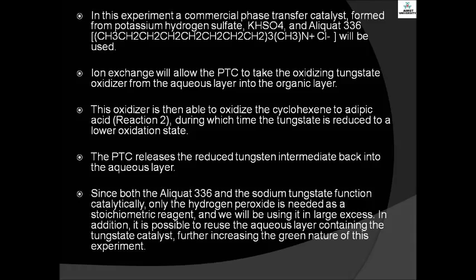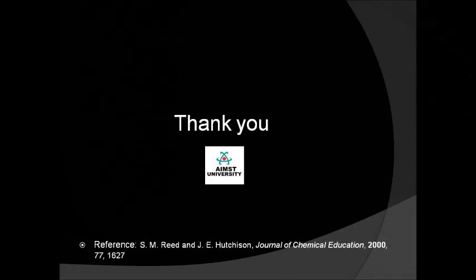Since both Aliquat 336 and sodium tungstate function catalytically, only the hydrogen peroxide is needed as a stoichiometric reagent, and we will be using it in large excess. In addition, it is possible to reuse the aqueous layer containing the tungstate catalyst, further increasing the green nature of this experiment. So here we come to the end of the green synthesis of adipic acid from cyclohexene.